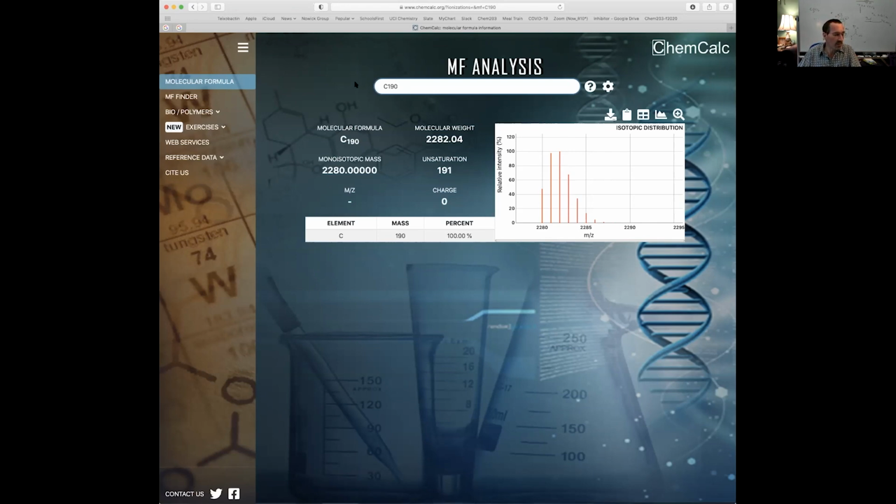If you're worried about the other stuff in the molecule and you say, well, what about hydrogens? Let's suppose I had a molecule with 256 hydrogens. We could just barely see deuterium, but it's not going to do much of anything.